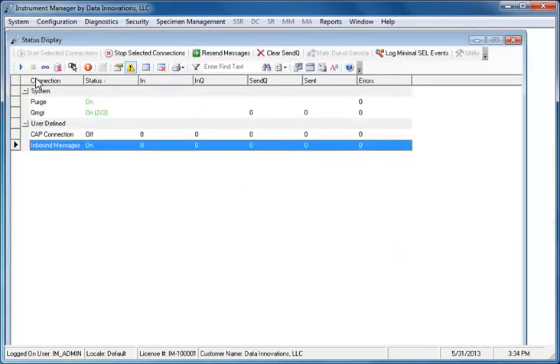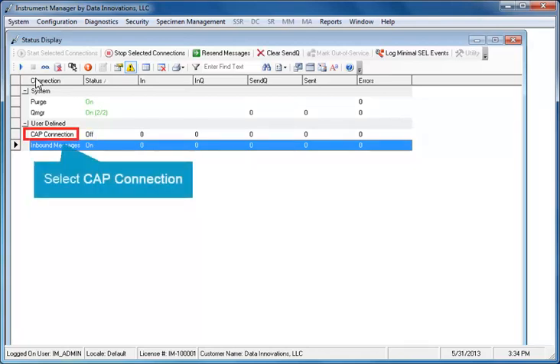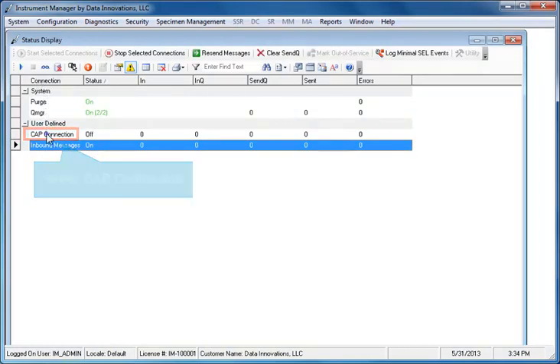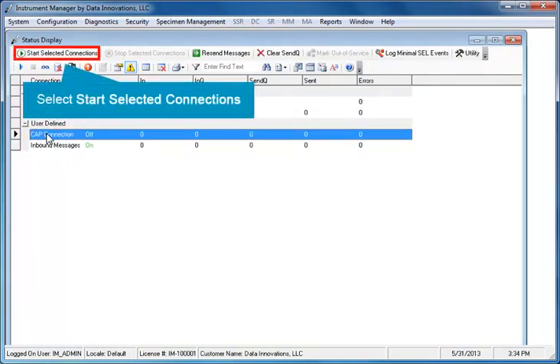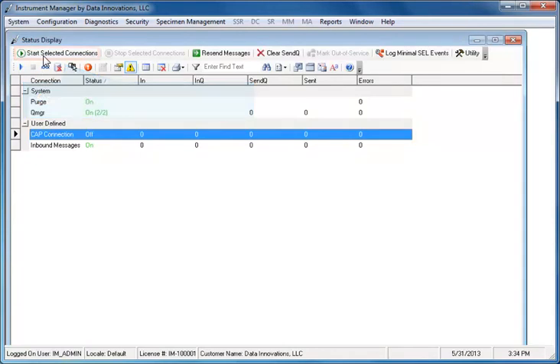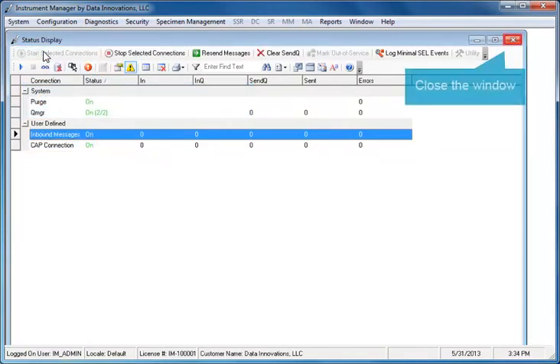In the Status Display window, the CAP Connection is currently off. Select the CAP Connection and click the Start Selected Connections button. The Connection Status changes from off to on. Now you can close the Status Display window.